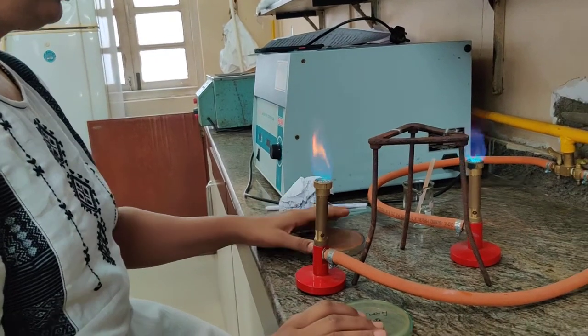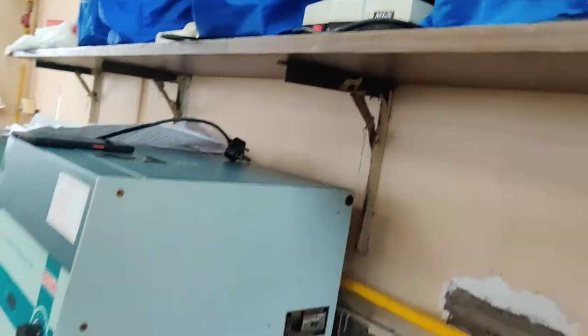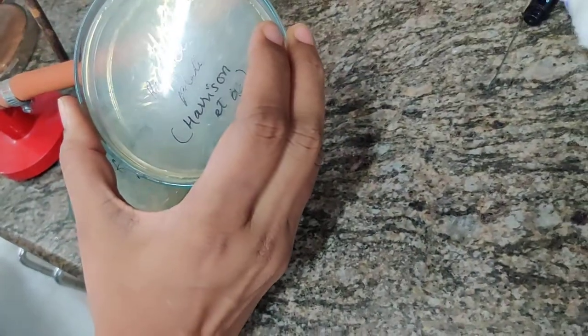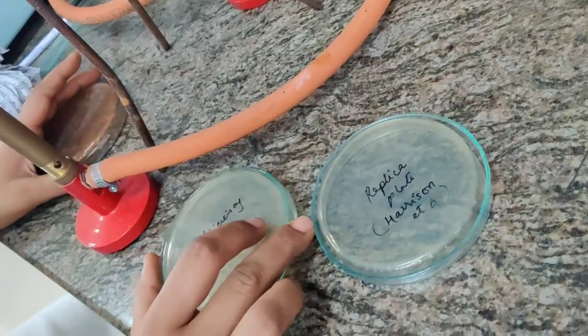We are studying the replica plate technique. Here we have our master plate which has isolated colonies on it. We are going to do the replica of this onto the replica plate, which is the auxotrophic plate, because we are looking for vitamin B12 auxotrophs. We also have an efficiency plate, which is a complete medium.